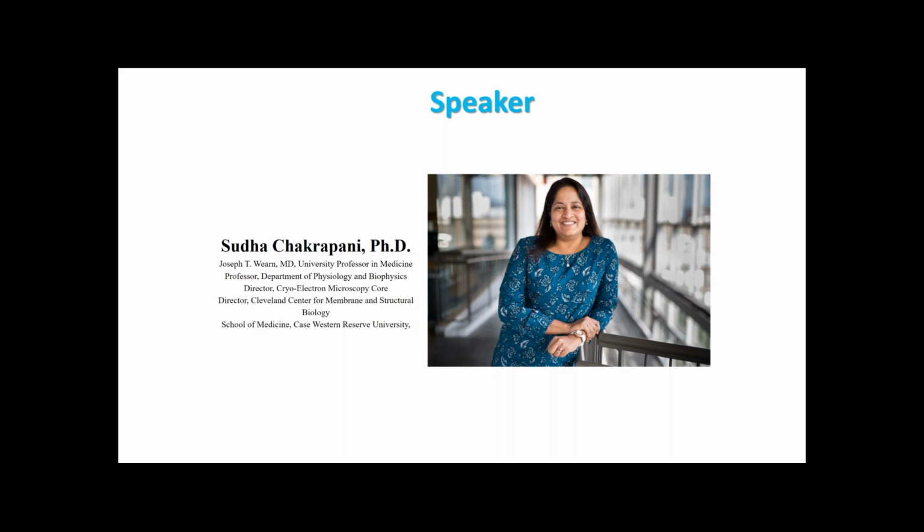Sudha's lab focuses on structural and functional studies of ligand-gated ion channels. And therefore, our talk today will focus on gating mechanisms and drug modulation of serotonin-3 receptors using cryo-electron microscopy. Without further ado, I will leave the electronic podium to Sudha.